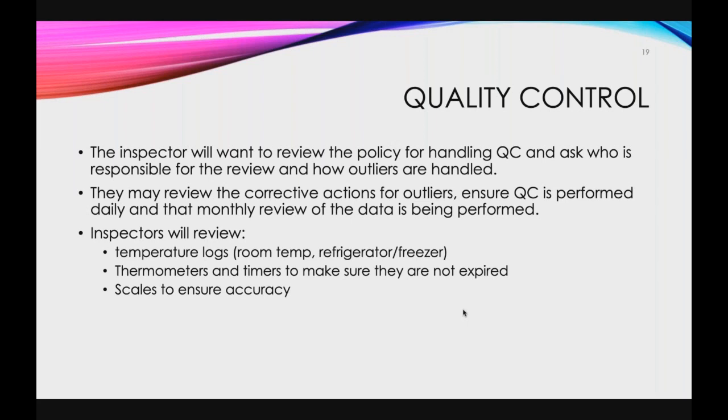You can do your own weigh-in with the weights twice a year to make sure it's giving accurate results. If you do use the weights, you have to get those calibrated as well, so keep that in mind. It might just be better to have it calibrated once a year. It all depends on your budget, because it is a little bit expensive, but you have to ensure that your scales are accurately reading out the right information.